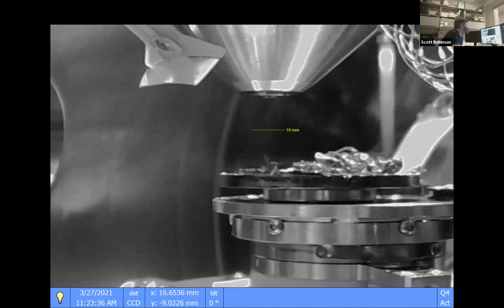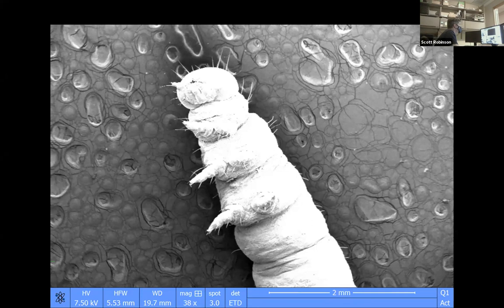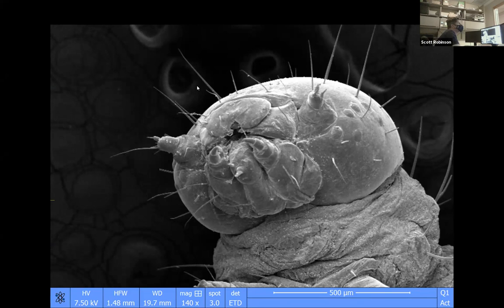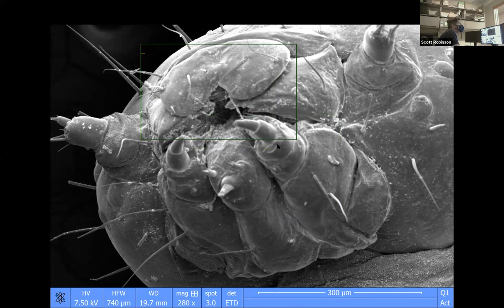You can see that the microscope is driving to that place. And now we're going to pull the contrast down a little bit. And let's go look at the mouth. Let's go look at the face of the caterpillar. And you can see its mandibles, but they're under, I forget what this other part's called in the middle. Probably the labrum.